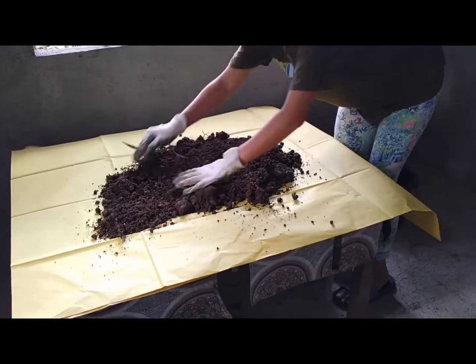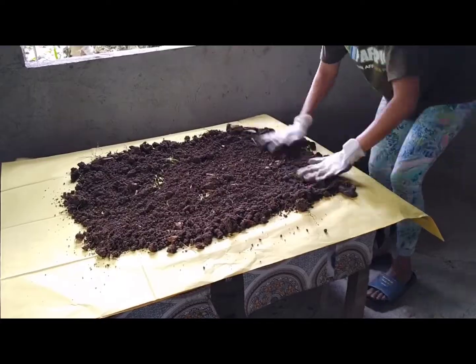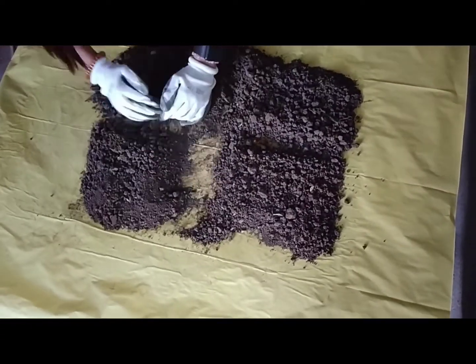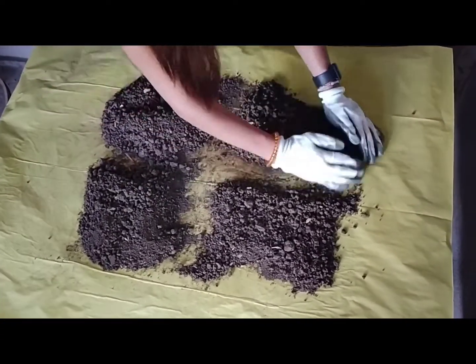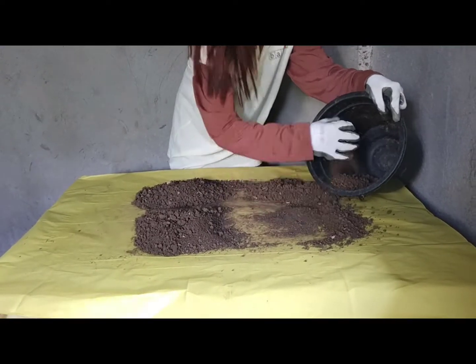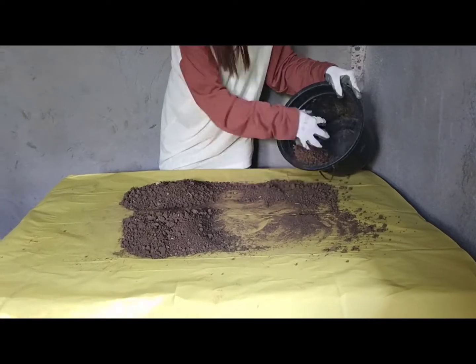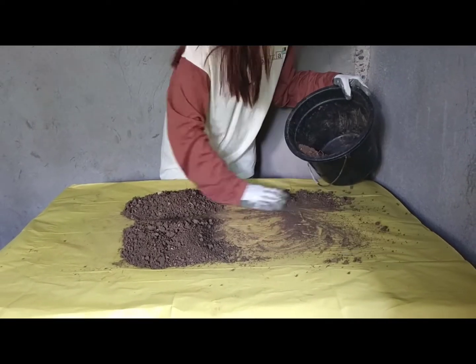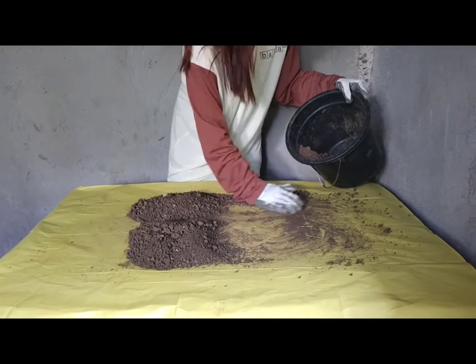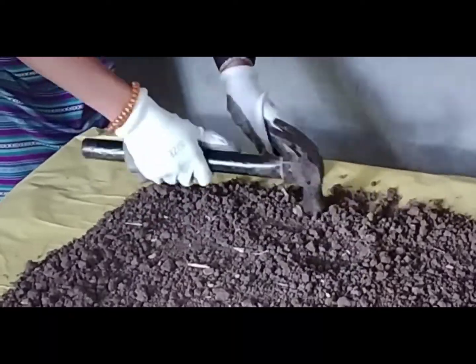And for the processing of the collected sample. To obtain a composite sample, spread the subsamples on a clean paper on a table or a drying board. Divide the soil into 4. Take 1 part and discard the other 3 parts. Moist soil samples must be air-dried as soon as possible before being bagged and sent to a soil testing lab. Drying is best accomplished by spreading each sample on paper to air-dry at room temperature.